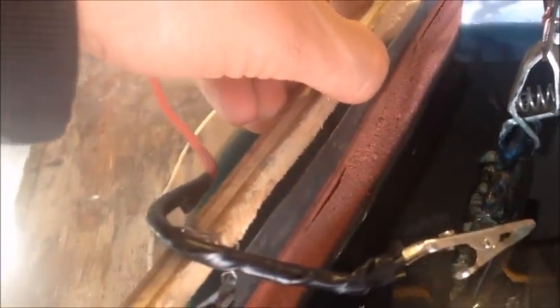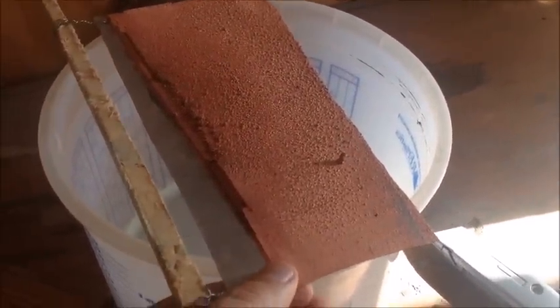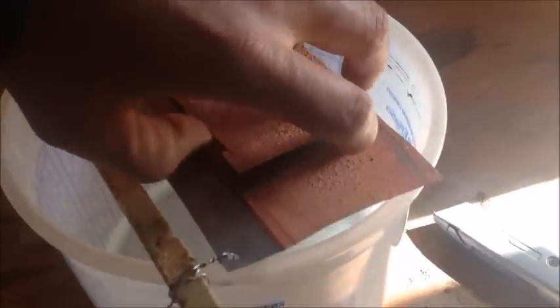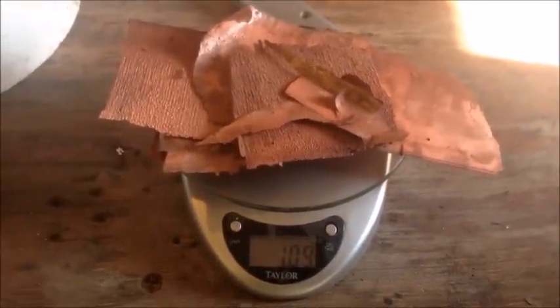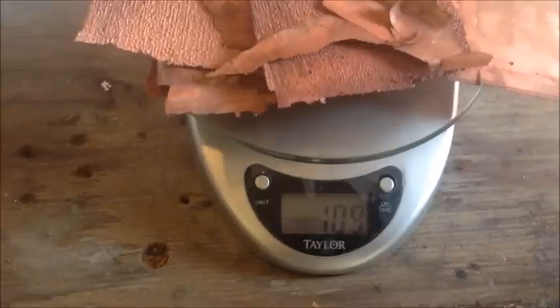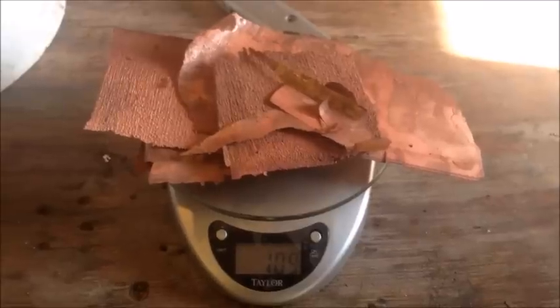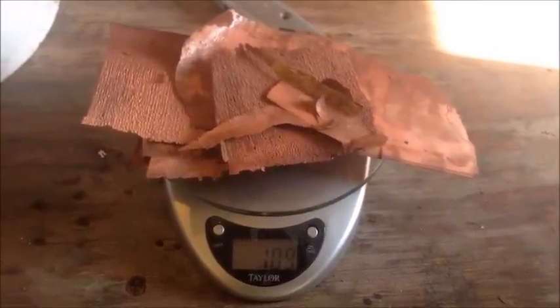I pulled out one of the stainless steel cathodes and gave it a little bend — you can see the whole copper sheet comes right off and you get a clean cathode you can start over with. From our 24-hour plating experiment we got 109 grams of copper plated out. That'll depend on voltage, current, and the surface area of the anode, but it gives you a ballpark for a 24-hour period.